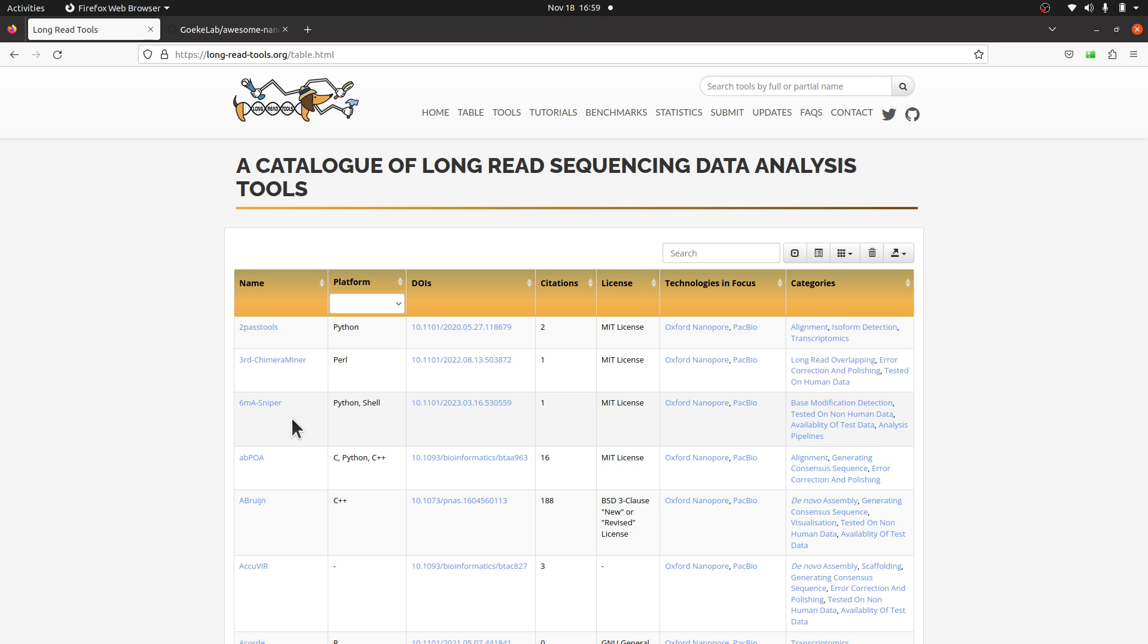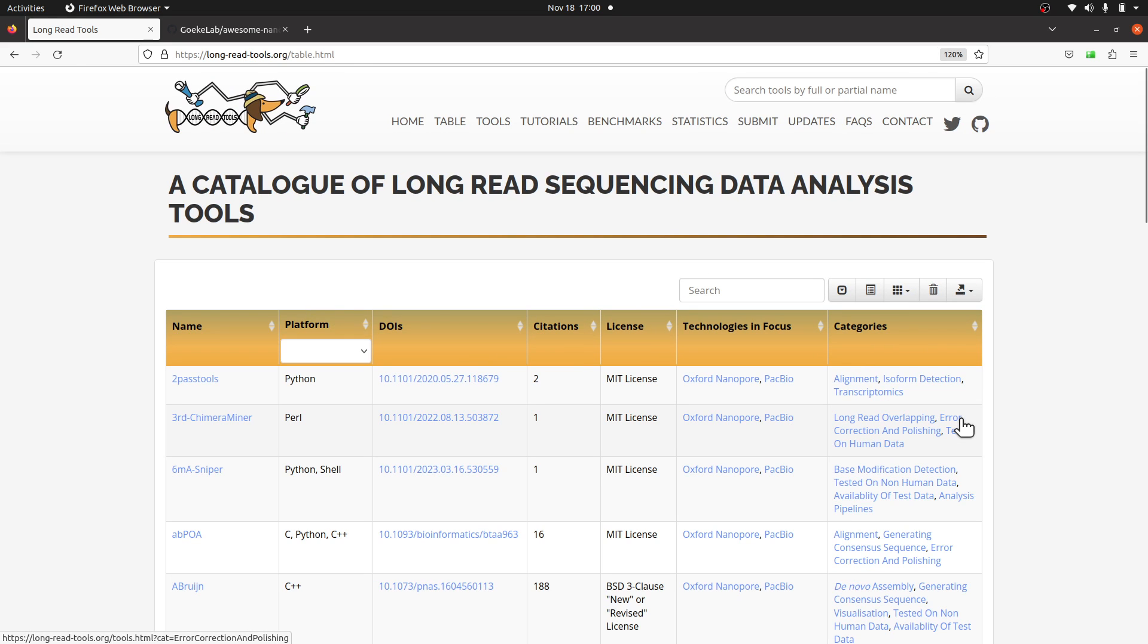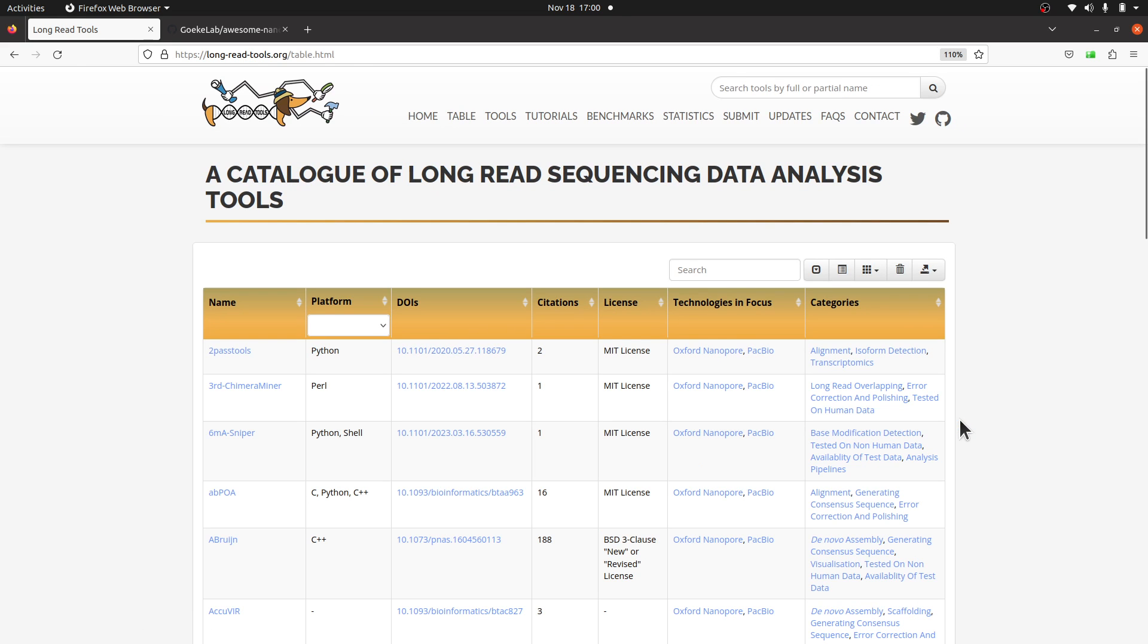When you're on this page, you see the lists—we have name, platform, UI, citation, etc., and categories. As a beginner, it's important to just look at the categories. Take a quick glance, so this will let you have an idea of what the tool does in terms of analysis.